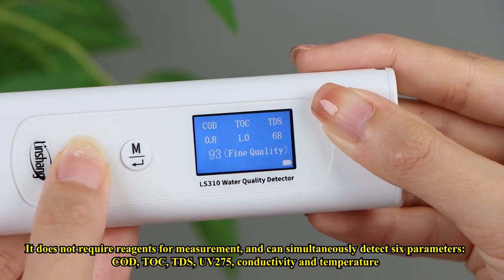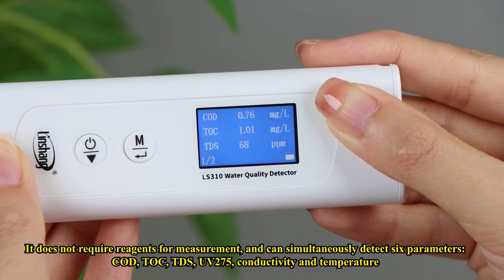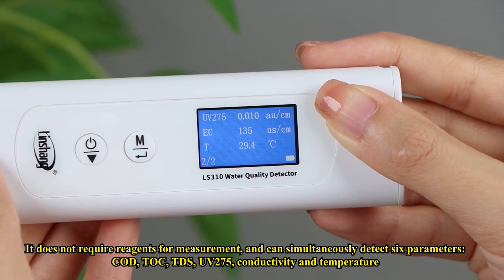It does not require reagents for measurement and can simultaneously detect six parameters: COD, TOC, TDS, UV-275, conductivity, and temperature.